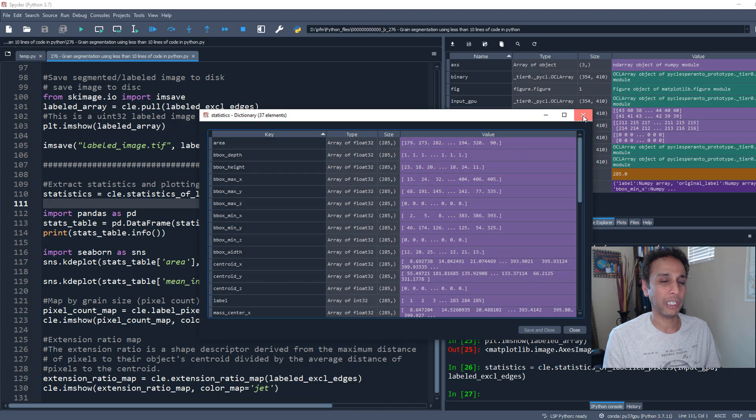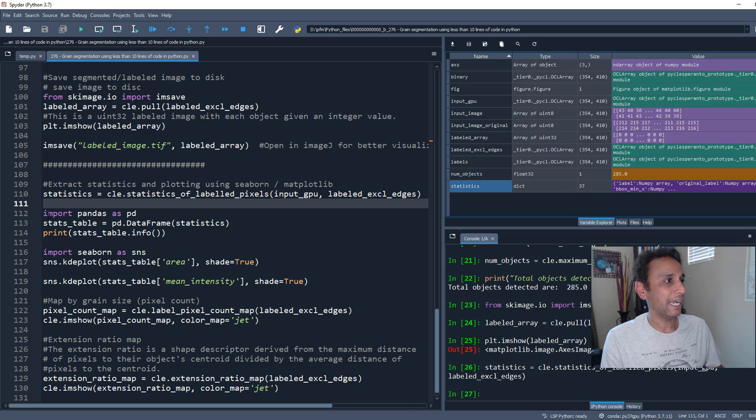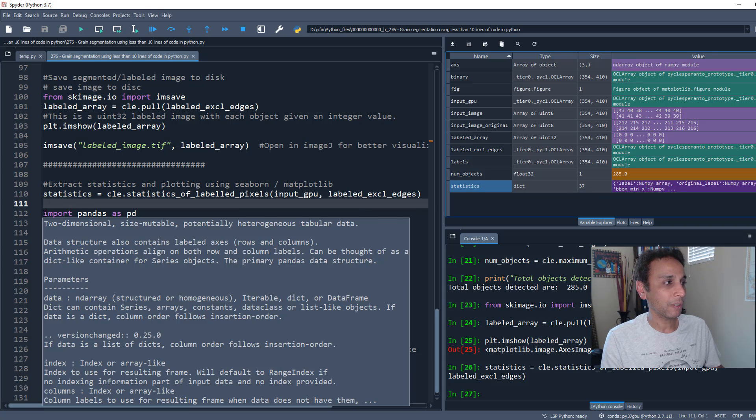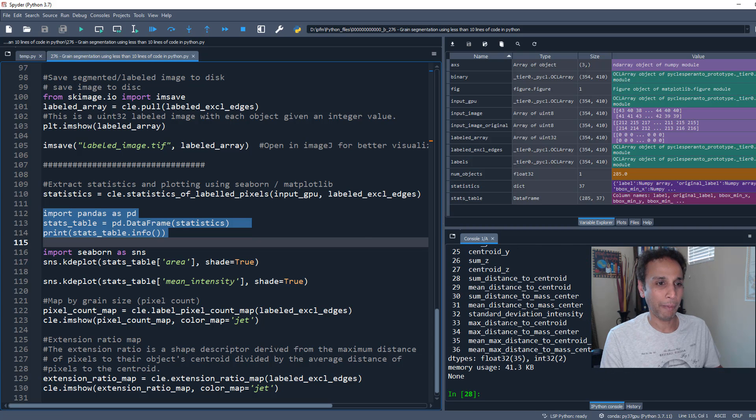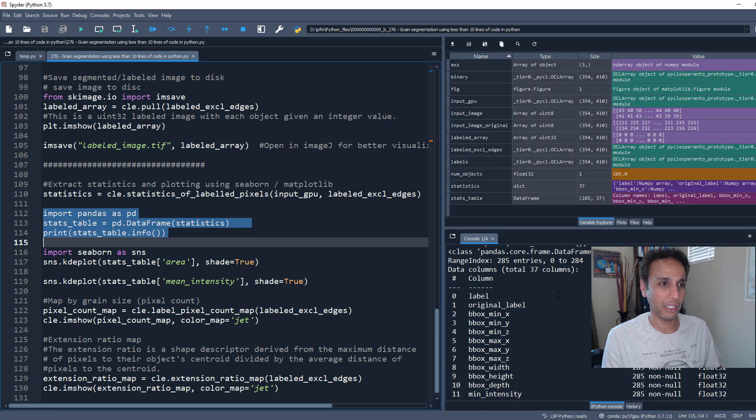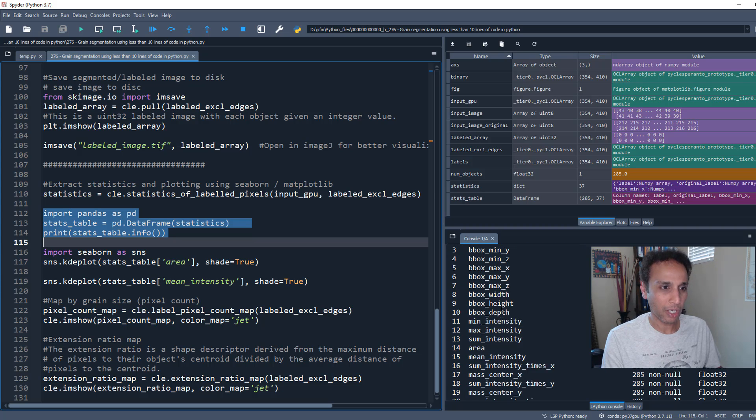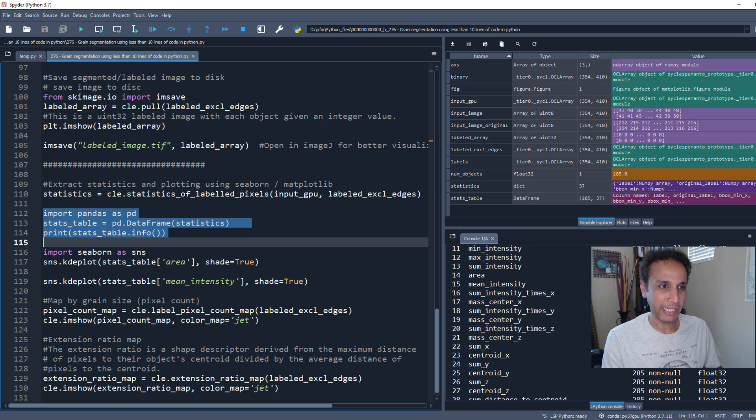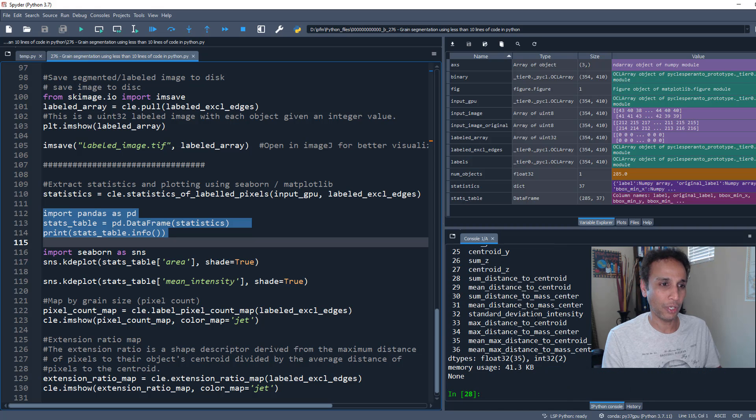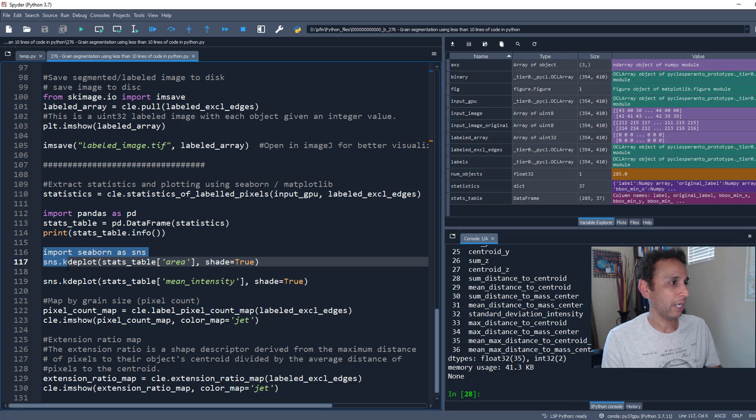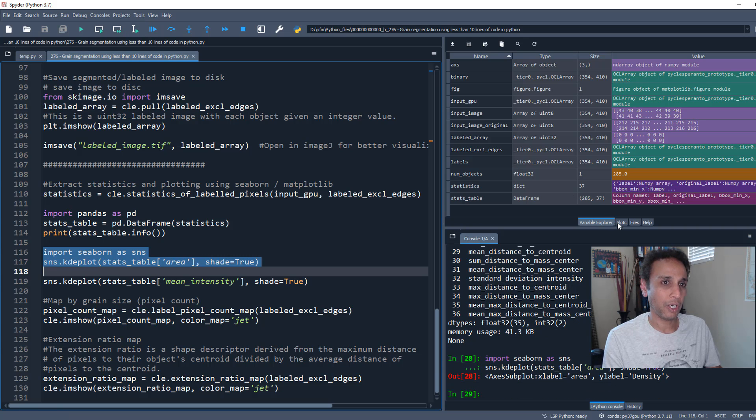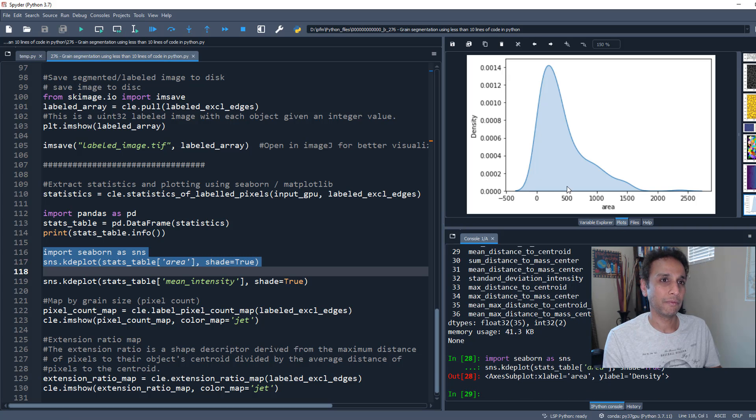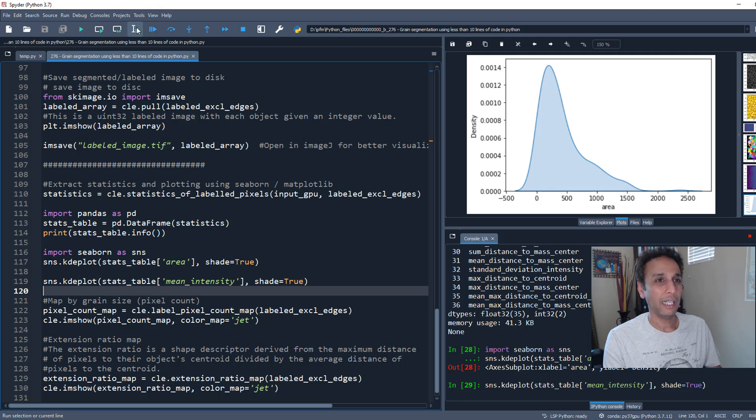The statistics is a dictionary of many things - it reports 37 different things. I'm more comfortable working with pandas, so I'm converting that into a pandas dataframe. Here are all the attributes exported: bounding box, mean intensities, mass center, and many other parameters. Once you have them, use seaborn or pyplot to plot your data.